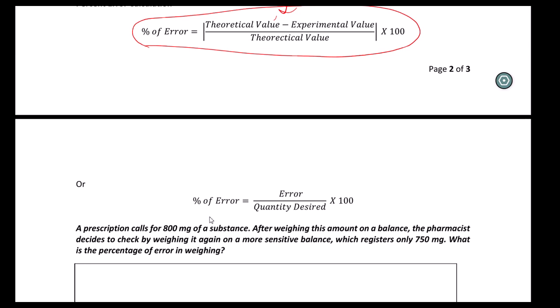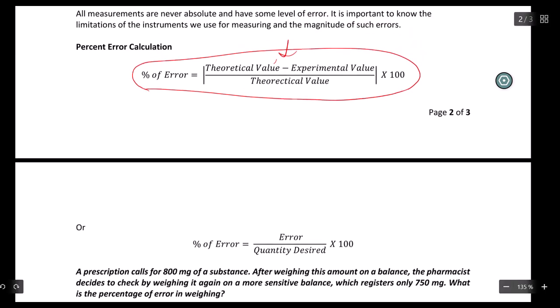If you were going to make lollipops that were medicated, and each lollipop was supposed to weigh, in theory, 2.54 grams, and you weighed a lollipop that you took out of your mold, and it weighed, let's say, 3.24 grams.